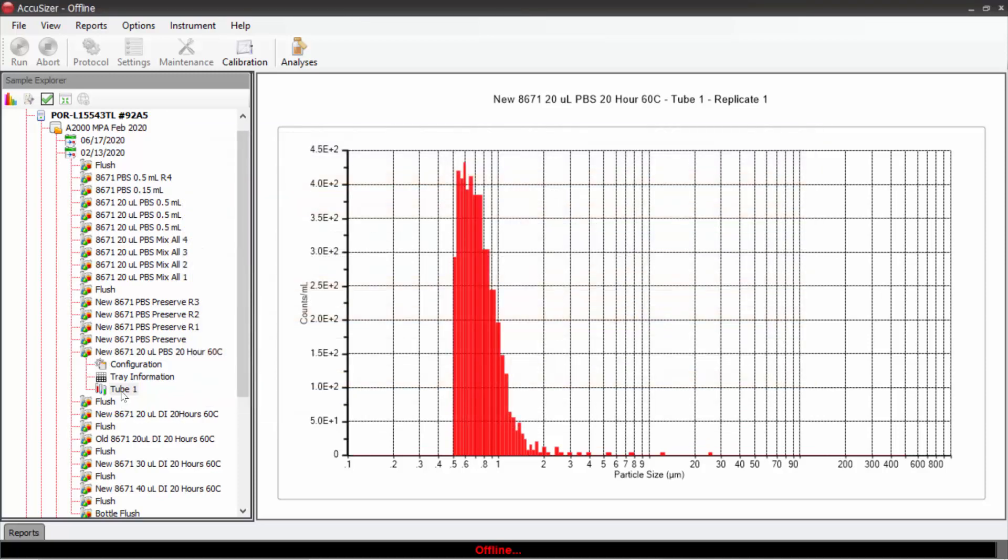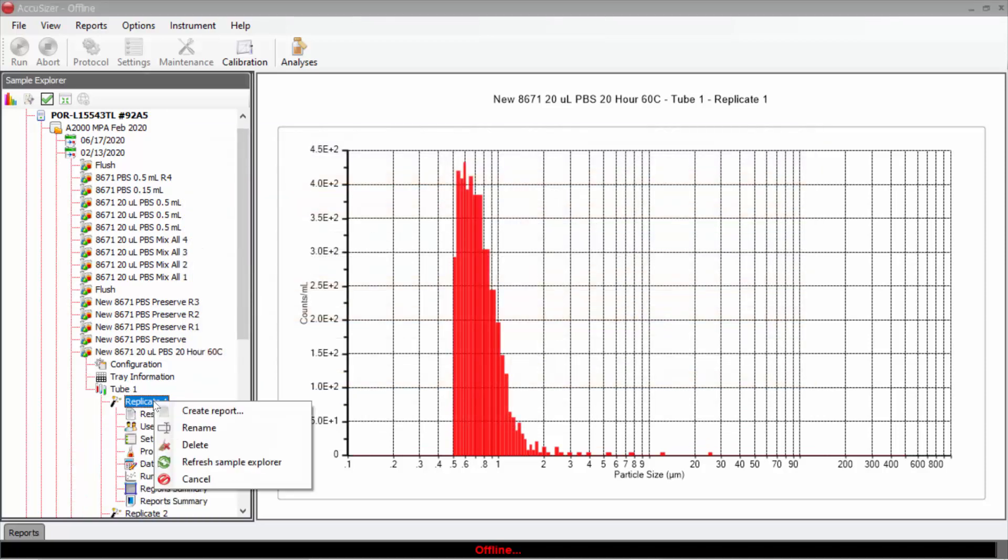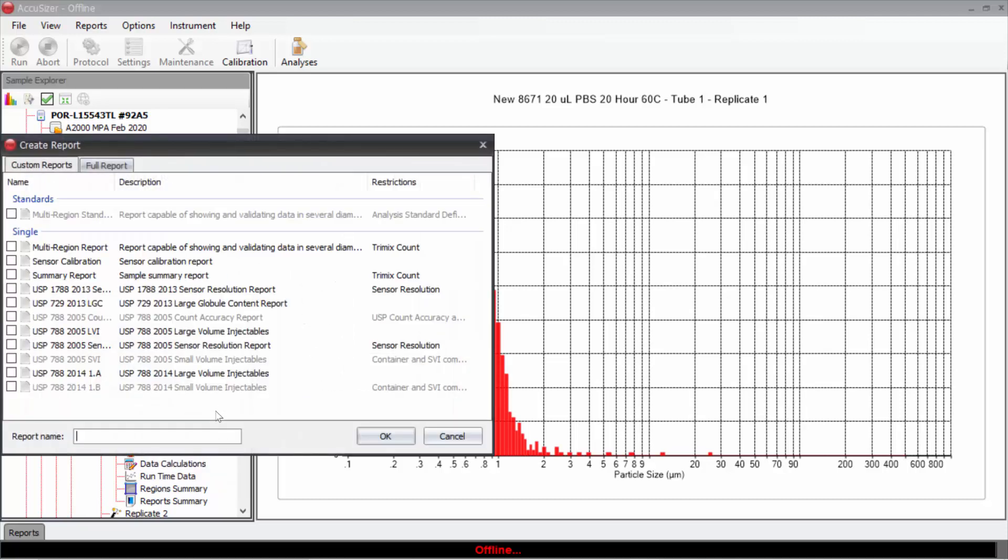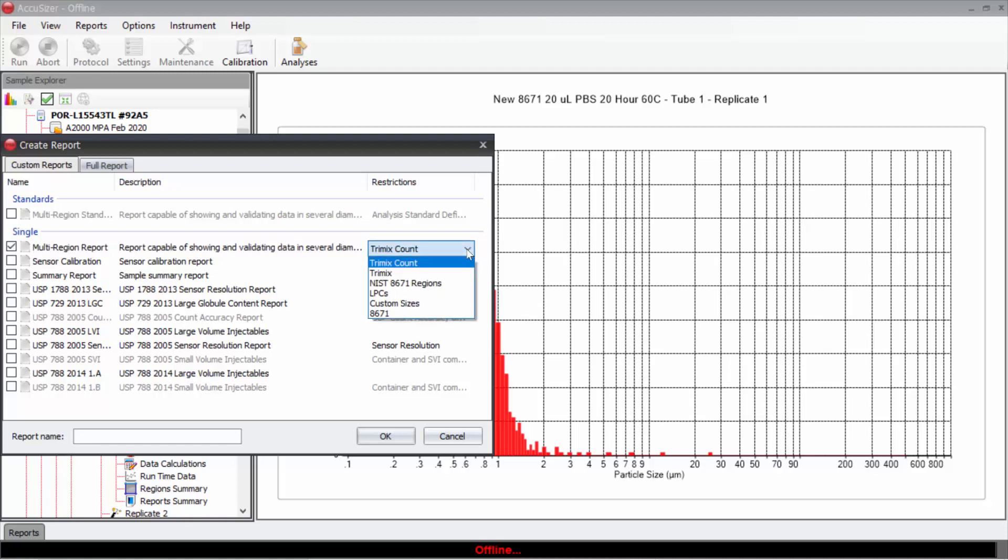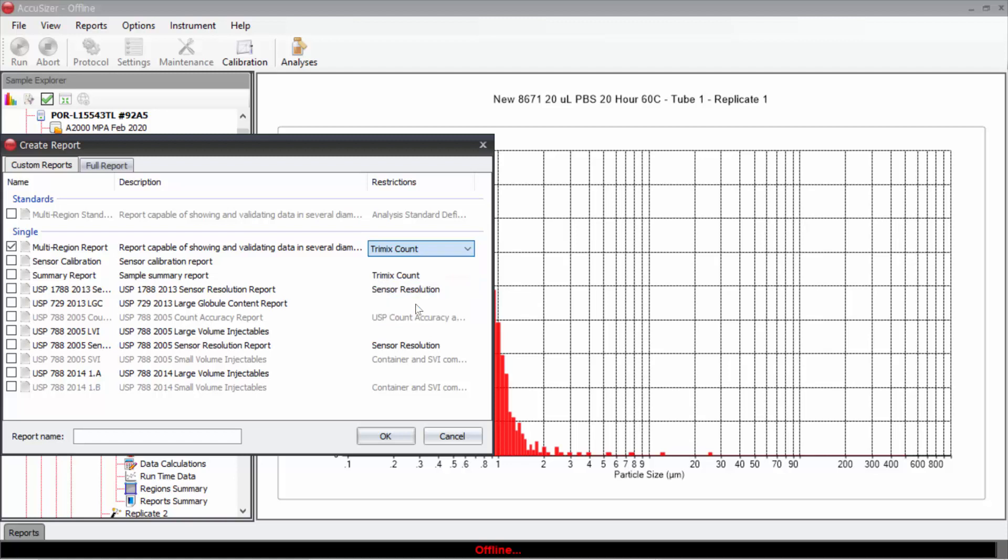For example, I will open this result. I will right click on create report. In create report, I will click on multiple region report. And in this box, I need to choose which of the sizes I'm going to create the report based on - custom sizes.